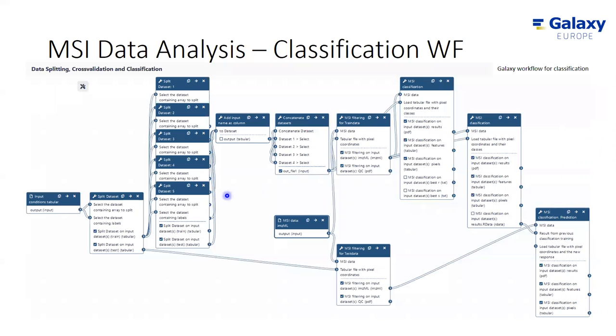With this preprocessed data, we can then go for the statistical analysis to build the classifier. We split the data set into a training data set to build a classifier and a test data set to evaluate its prediction ability. We split the training data set again for a cross-validation training to find the best parameter for the classifier algorithm. So in total, we use the classification tool three times: first to test the different parameters and identify the best ones, then again with the best parameter to build the classifier, and then again to test the classifier's performance on the test data set.